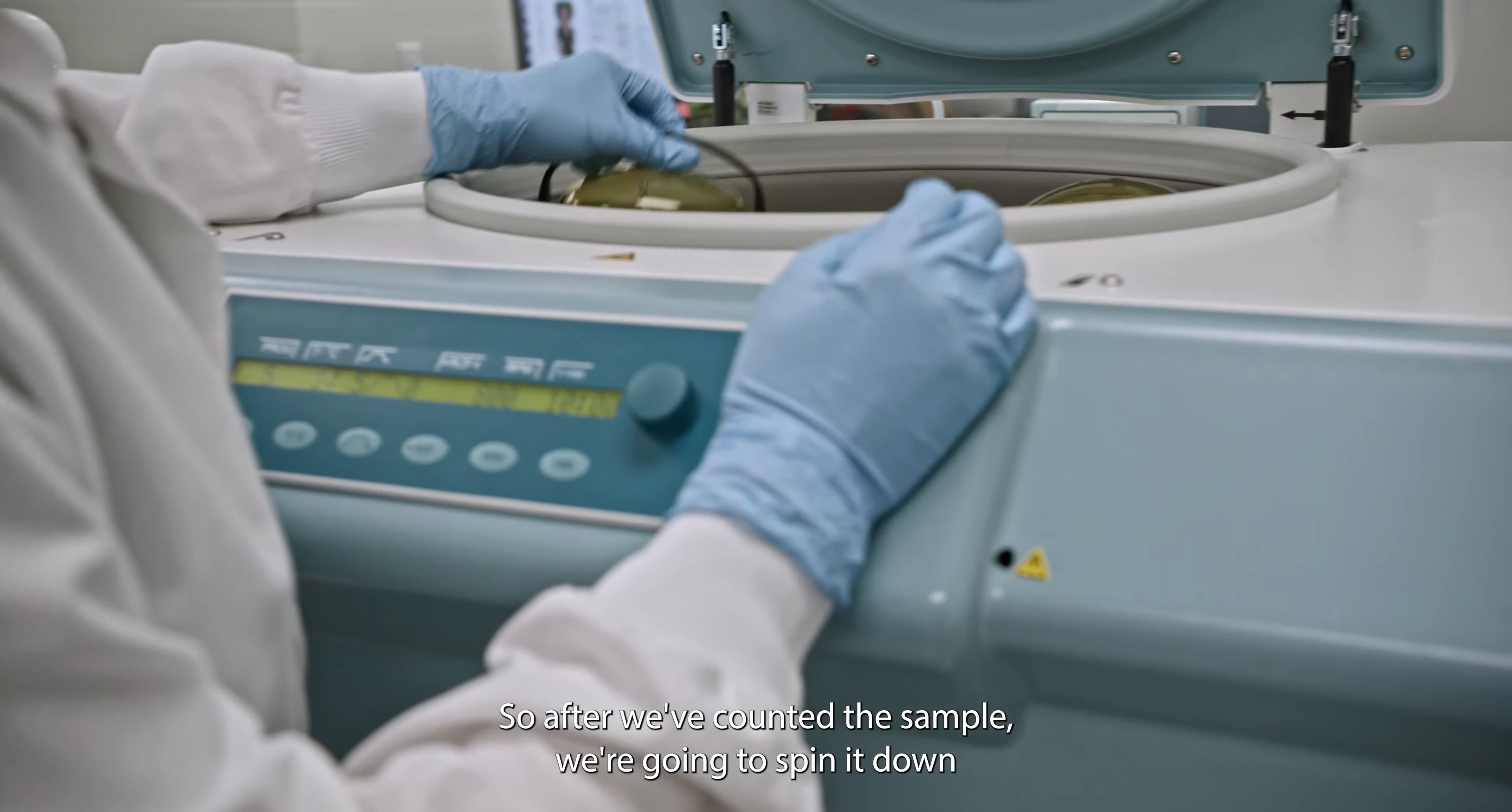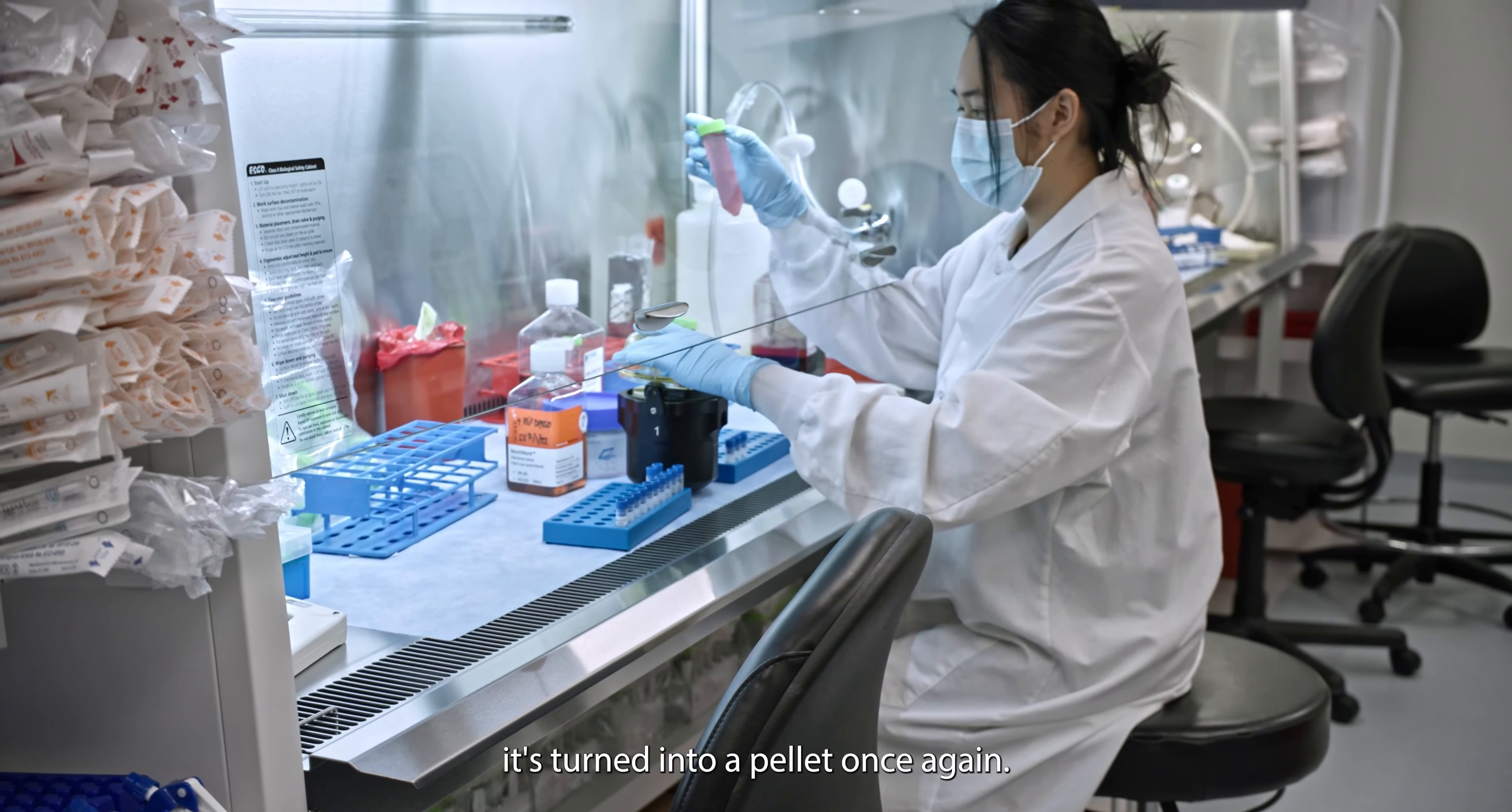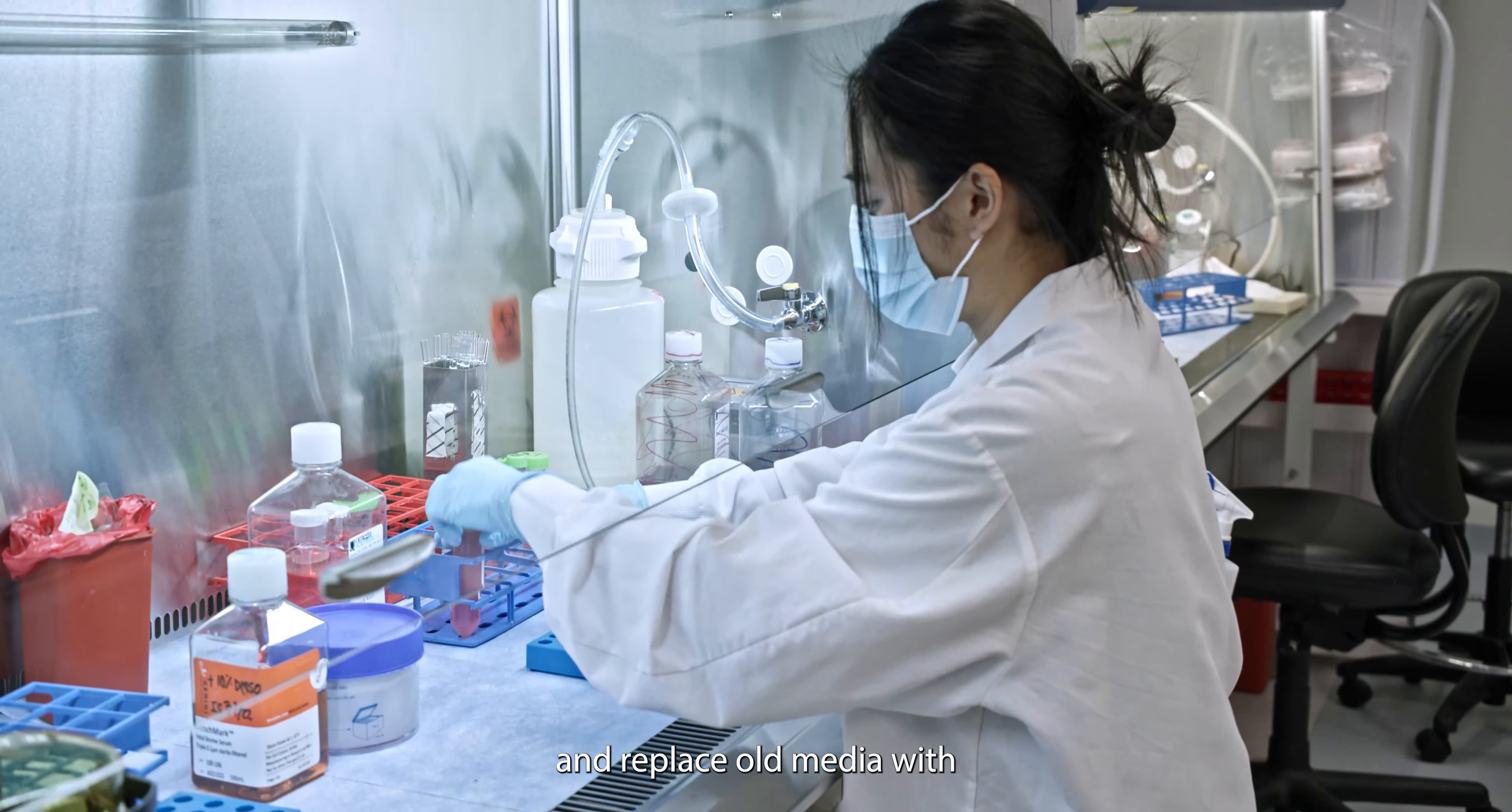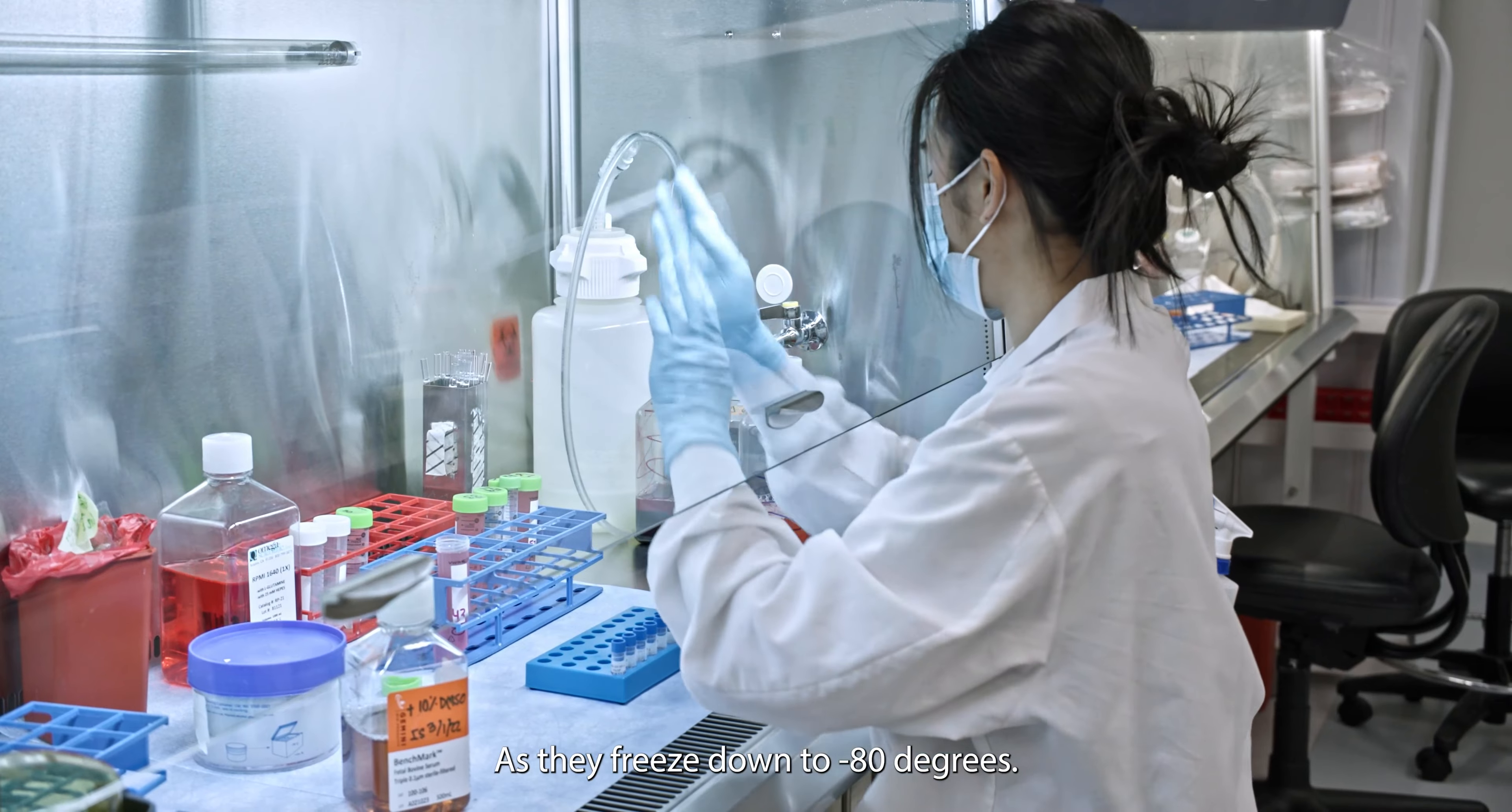So after we've counted the sample, we're going to spin it down. And you'll see that it's turned into a pellet once again. What we're going to do is vacuum off all the extra media. And replace the media with this FBS, which will keep the cells safe as they freeze down to minus 80 degrees.